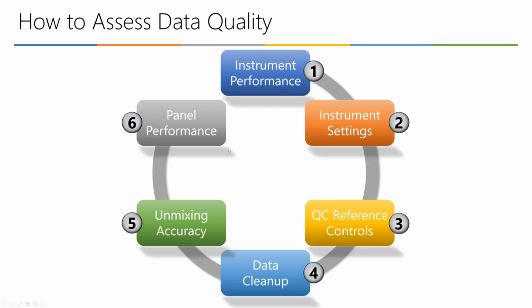So make sure that before you store a reference control, your panel has been well validated, and that the controls that you're storing give you good unmixing.